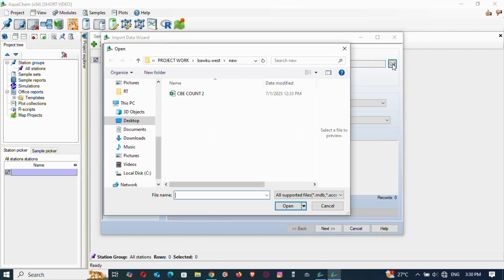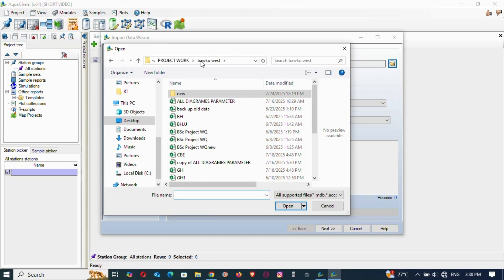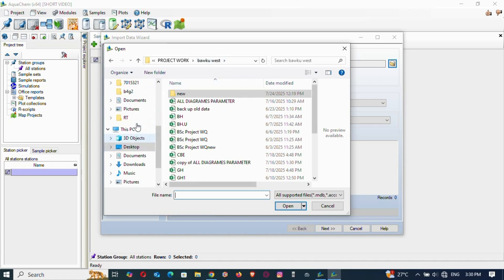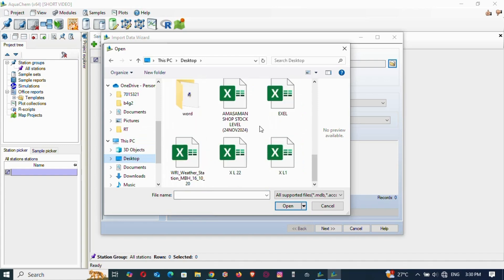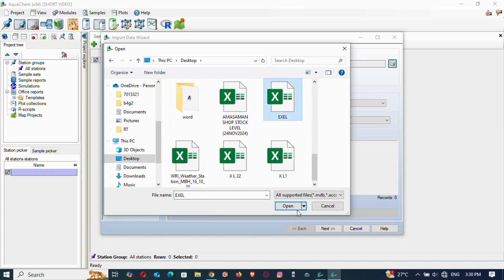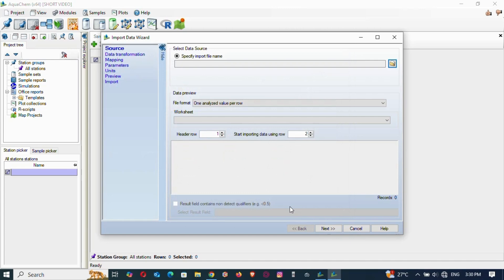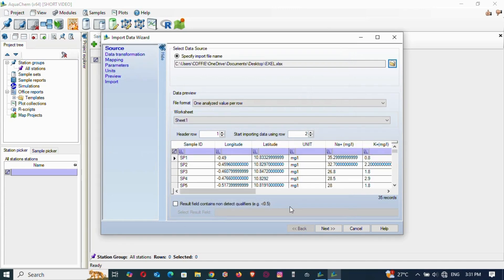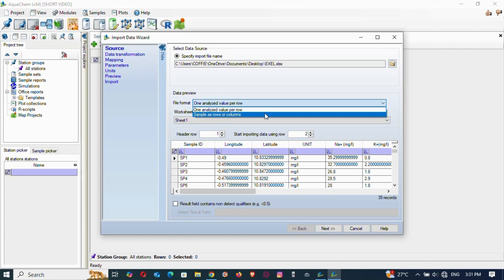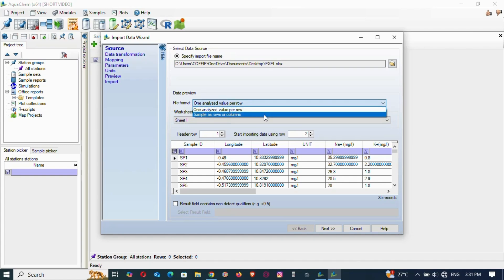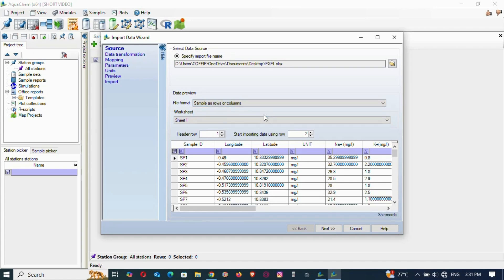Browse and select the file you want to use. I have my data on the desktop saved as an Excel file. Once selected, change the setting to 'Samples as Rows or Columns,' then click on that option and proceed to Next.